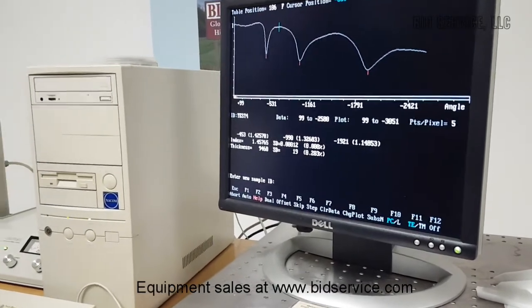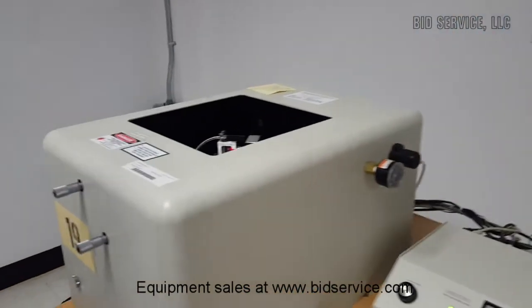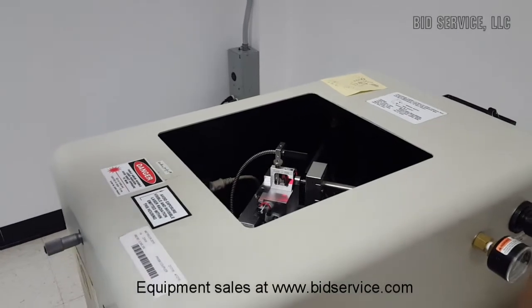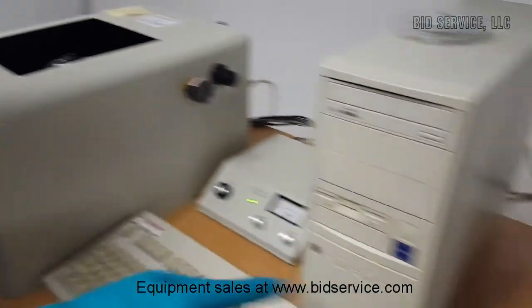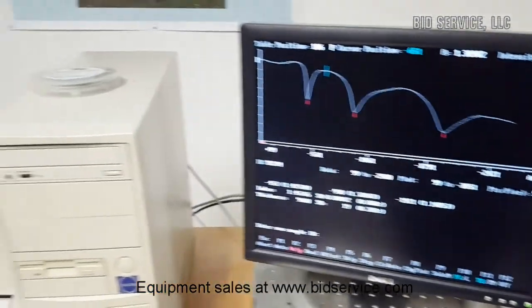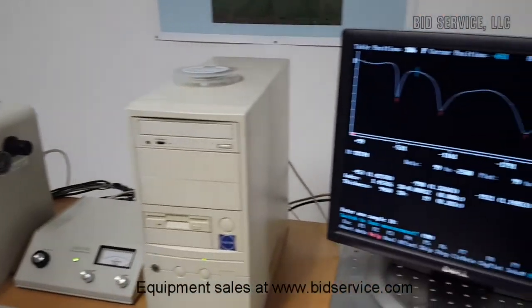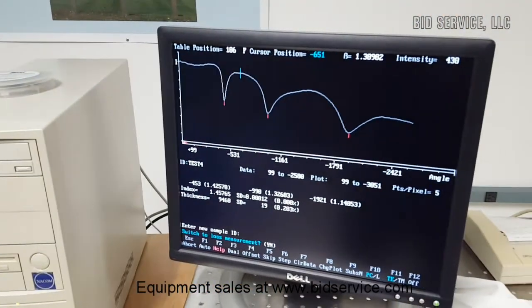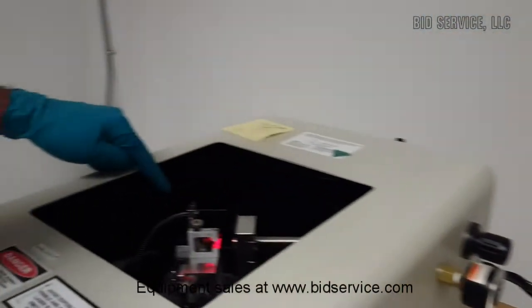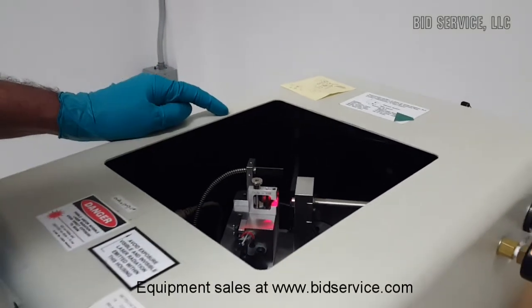Now I'm going to show that the waveguide loss measurement option works. I'm going to select F10. First let me remove the sample here. Then if I select F10, it says switch to loss measurement. I enter Y and then F1.